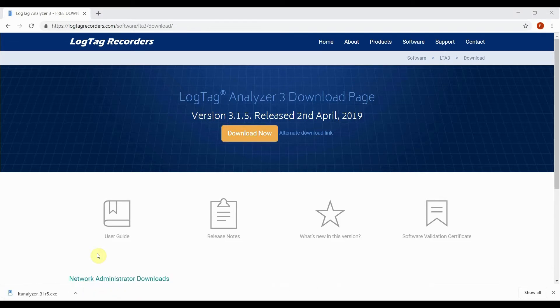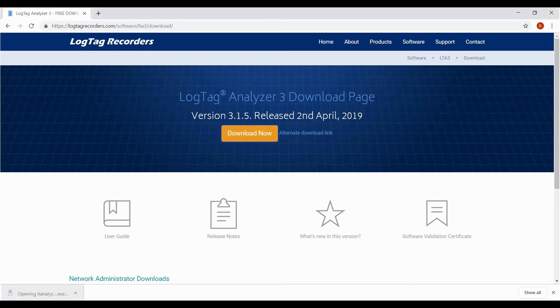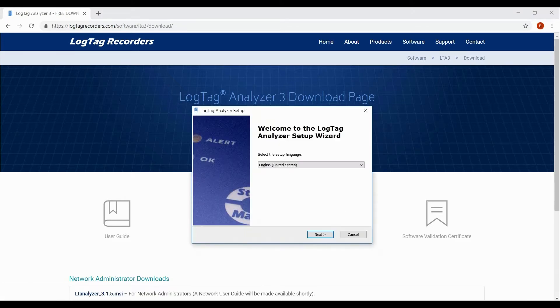Once downloaded, open the file by clicking on it from your browser's download bar or in the downloads folder. English is selected by default on the first screen.